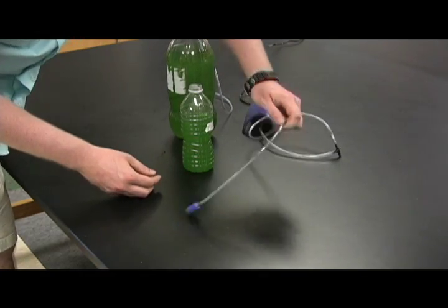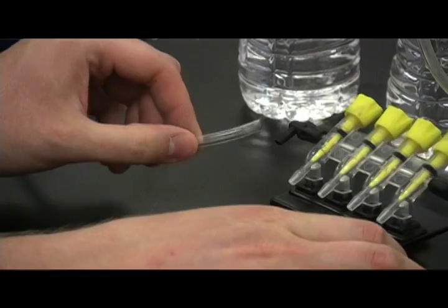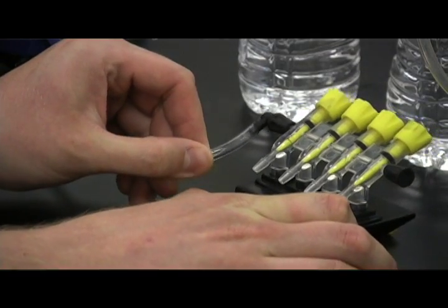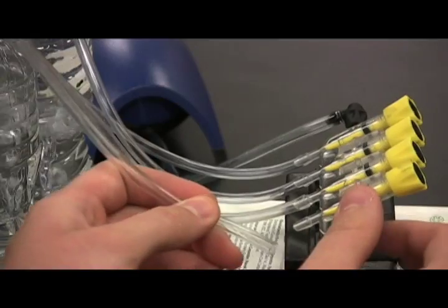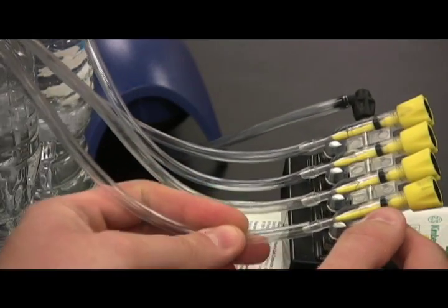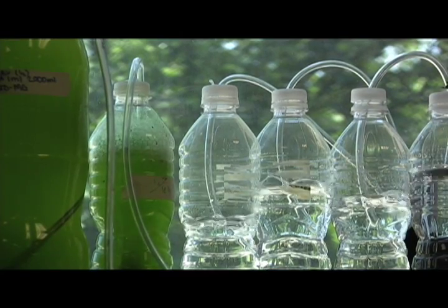To set multiple bottles up in parallel, a gang valve is ideal. We connected the gang valve to the air line running from the air pump, then connected the bottle's air lines to the valve. We opened the valves to allow flow to both bottles. The bottles were then placed in the window, and the setup was complete.